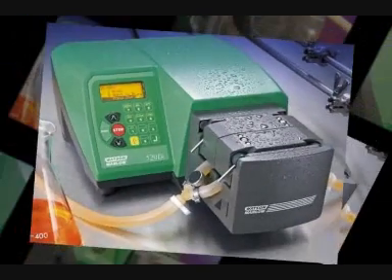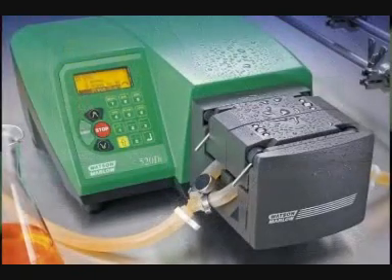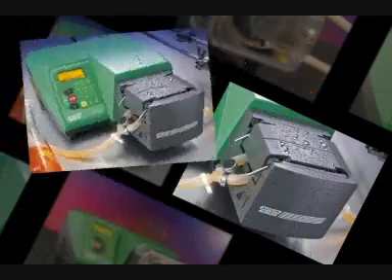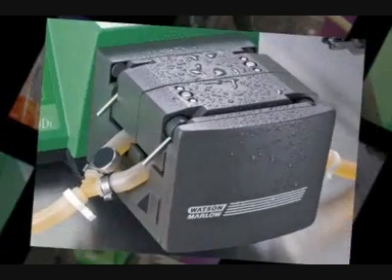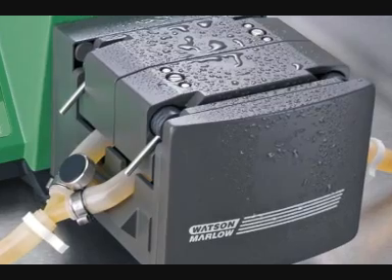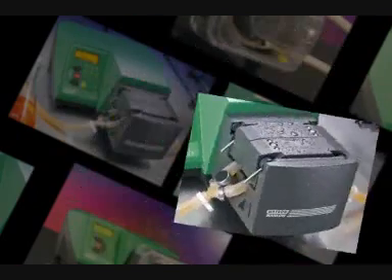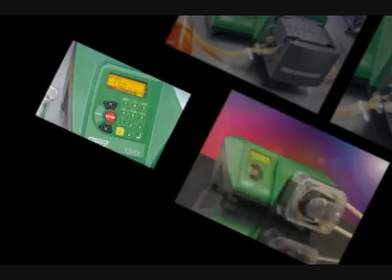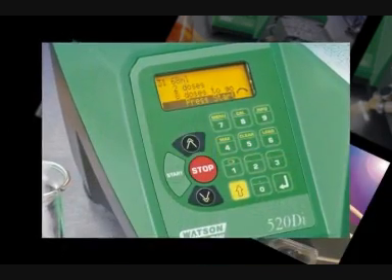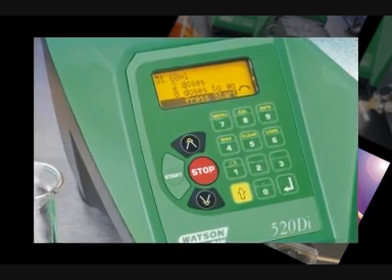The 520 range from Watson Marlow is perfect for fermentation and other biotech and pharmaceutical applications. It offers a high-powered brushless DC motor which gives it controllability from 0.1 RPM to 220 RPM, with speed accuracy to 0.1%. It provides precision dosing and metering and excellent uninterrupted batch consistency.